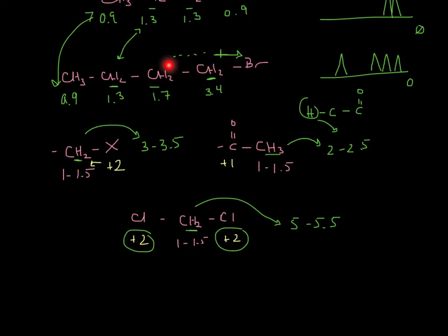So instead of going up 2, right? So these hydrogens go about 2 higher than normal. So instead of being 1 to 1.5, they show up between 3 and 3.5, which we see in terms of the actual evidence of where it shows up on the spectrum. These guys show up about a quarter of that. So this guy is experiencing essentially a +2.